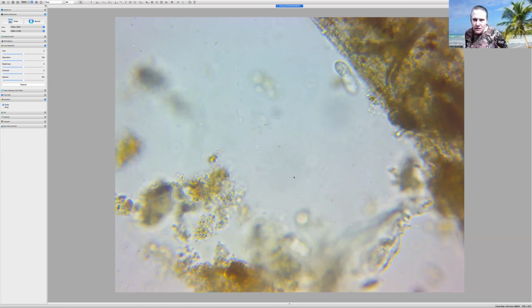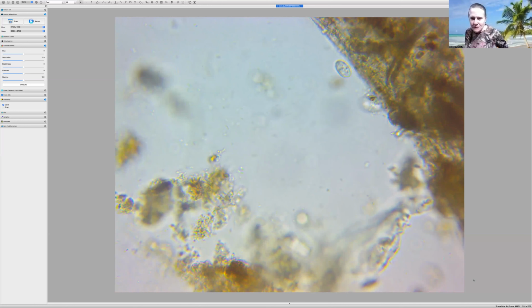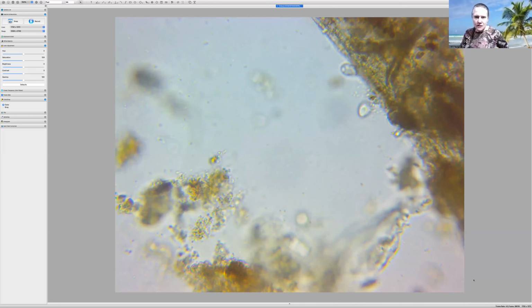Oh, this one's going to shove that one out of the way. So it's very possible that is, I don't know, she's looking like a ciliate almost too. She's really got that going. Now she's caught something she wanted to eat. Okay. Not the exact stalk ciliate I was looking for, but definitely a certain species of protozoan. And those two look like they're having fun. They're working together to bring in all those different varieties of bacteria to feed on.